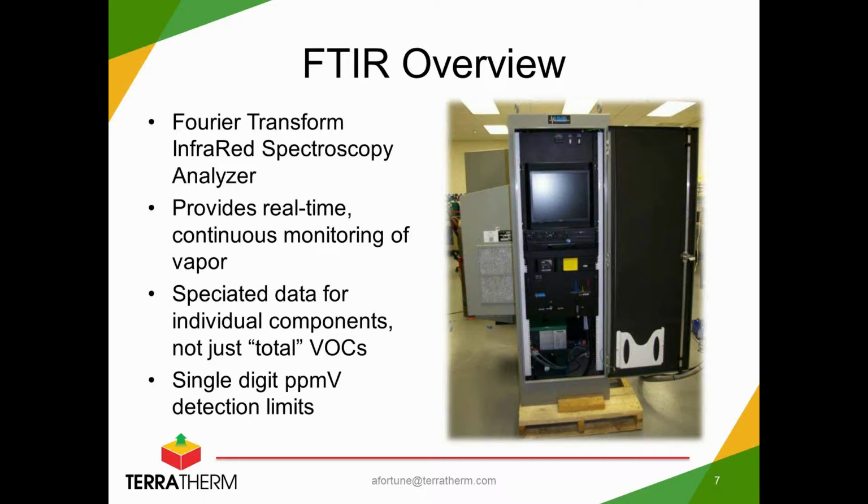Similar to those other screening techniques that I mentioned, the FTIR should also be considered a screening tool, and it has a similar range of detection. So we're talking about kind of single-digit ppm detection limits.